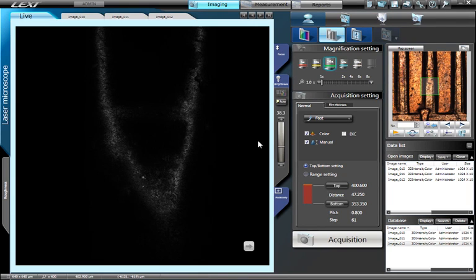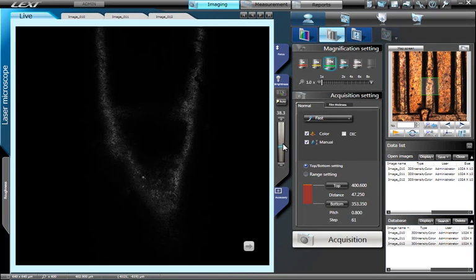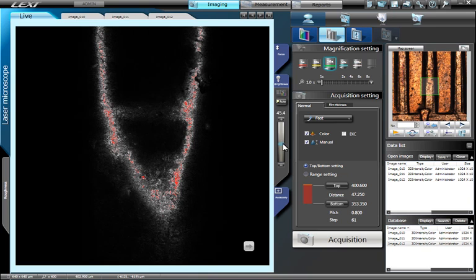Now, set your brightness in laser mode, being careful not to over-saturate, as indicated in red. Typically, it is a good idea to set the brightness as high as possible without over-saturating.